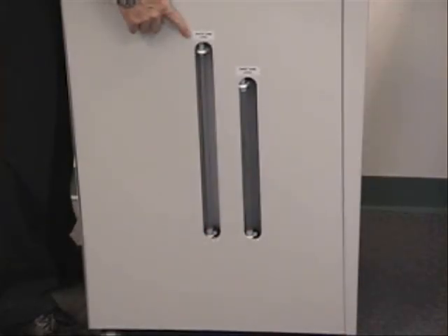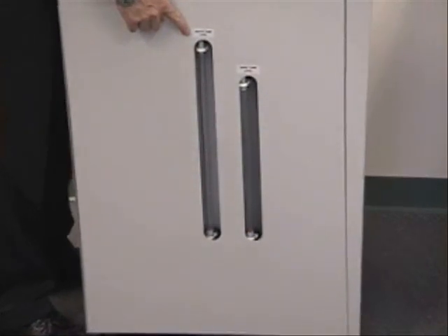In addition to the internal electronic level sensors for each tank, this unit also provides two external sight gauges.